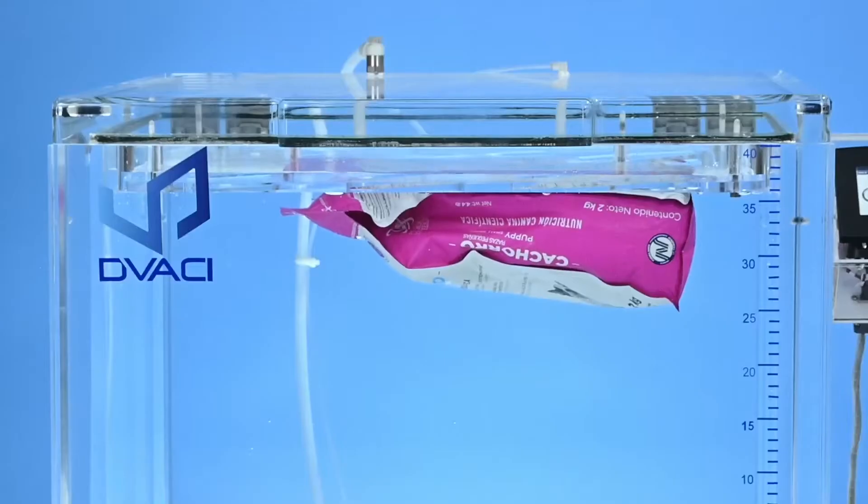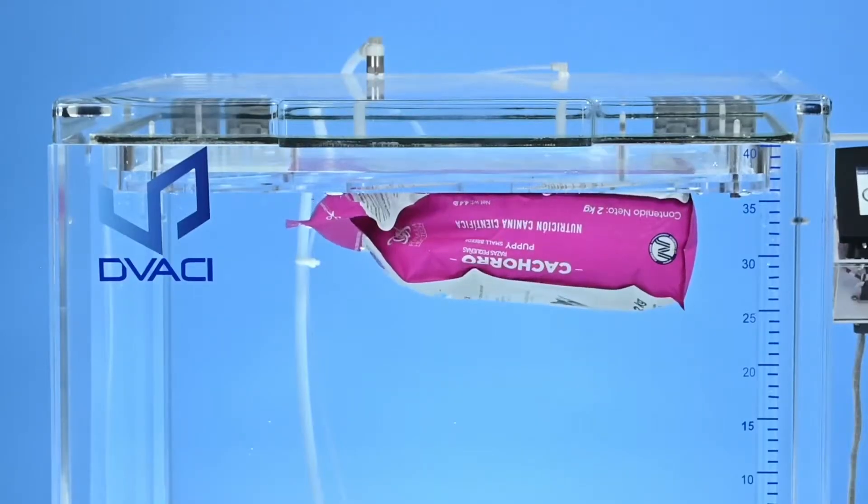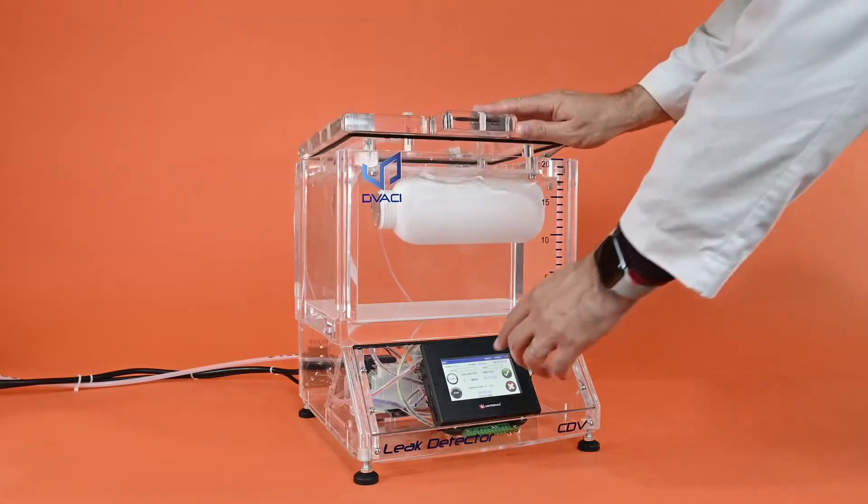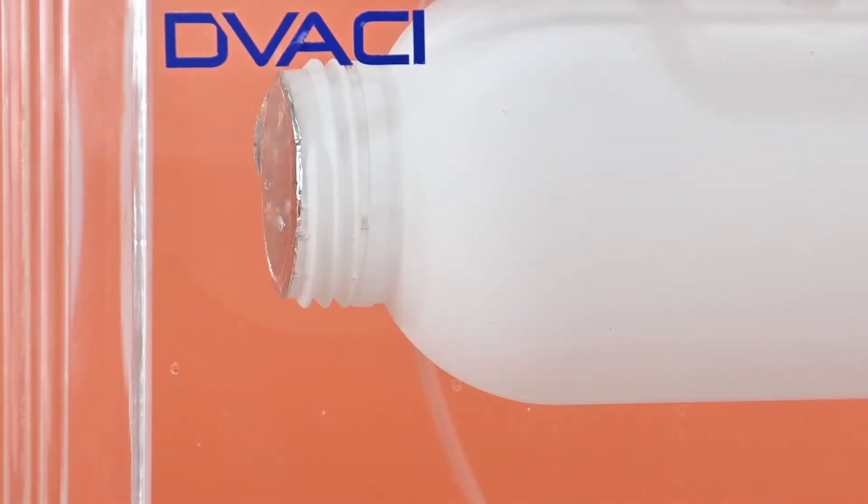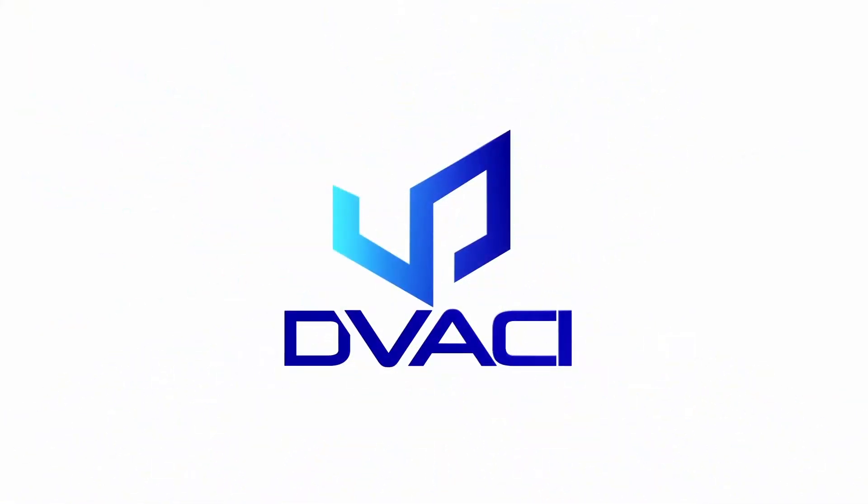Our CDV vacuum chambers are designed to perform leak tests to determine the quality and integrity of your product packages. For this purpose, we have developed a complete product line consisting of five sizes with different options.